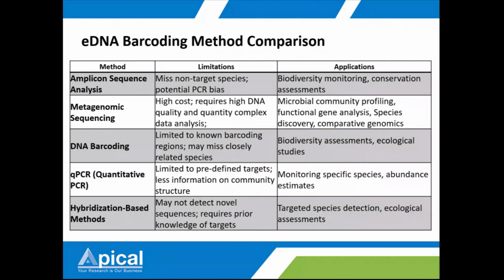So you need a high amount of DNA, especially if your source of samples has low abundance of organisms, or perhaps has a high amount of contaminants. For example, in soil, you might have phenolic compounds that might cause a problem during the library preparation process. So this might contribute to the difficulties of running metagenomic sequencing, right?